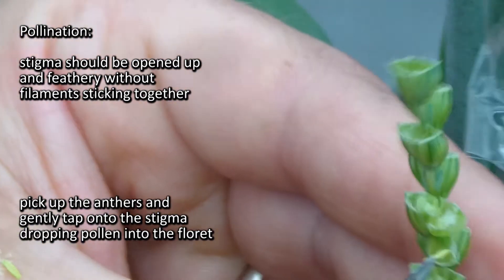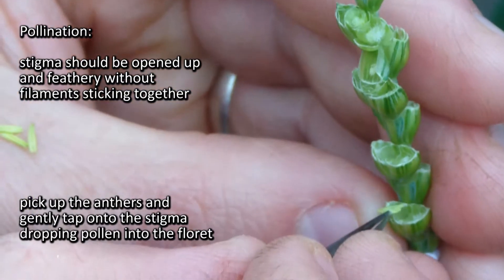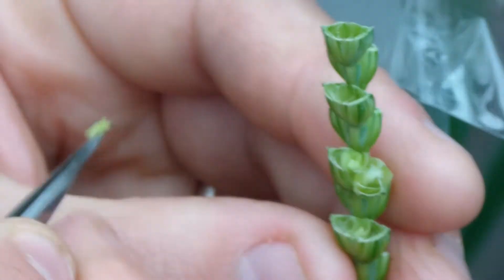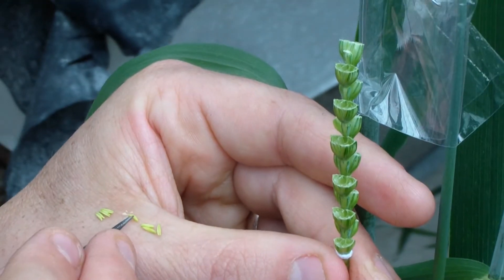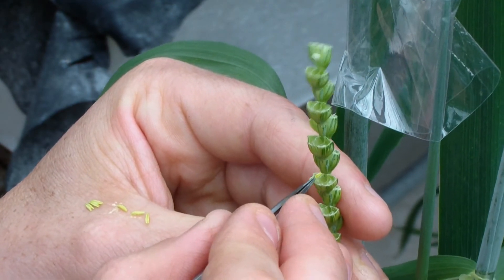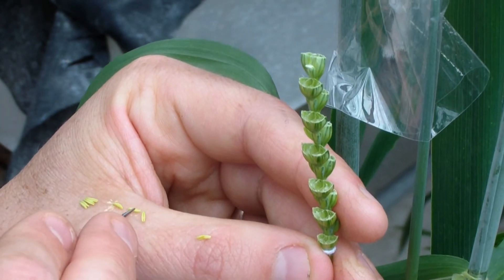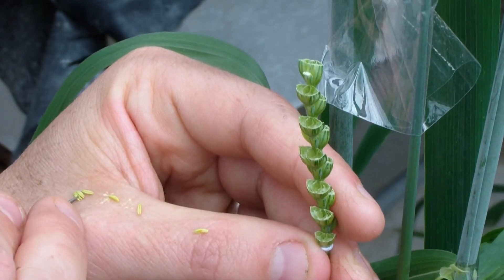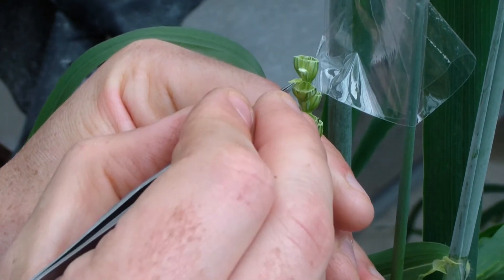All I do then is pick the anther up and just gently tap it onto the stigma, onto the florets. I pick each one up in turn, tapping, knowing that pollen is dropping down into the floret to fertilize these florets. So it's just tap, tap, tap — not ramming the anther down into it. I just want to be tapping pollen onto the tops of these florets so that it drops down. You'll see the pollen flying around at this stage.